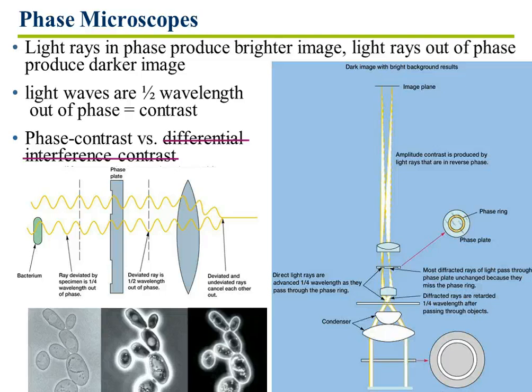Okay, phase contrast. Microorganisms and cells of any type, or it could be caffeine crystals, it doesn't matter. When you put them on a microscope and light goes through these objects, the light goes through at different rates because of the refractive properties of the object. So when you shine a light through a cell, you get different light movement through the fluid, and if it hits any organelles or a nucleus, things like that. And then, of course, coming out the other side of the cell, through the cell membrane, and then eventually it's got to hit the lens. So there are a lot of things kind of blocking light rays.